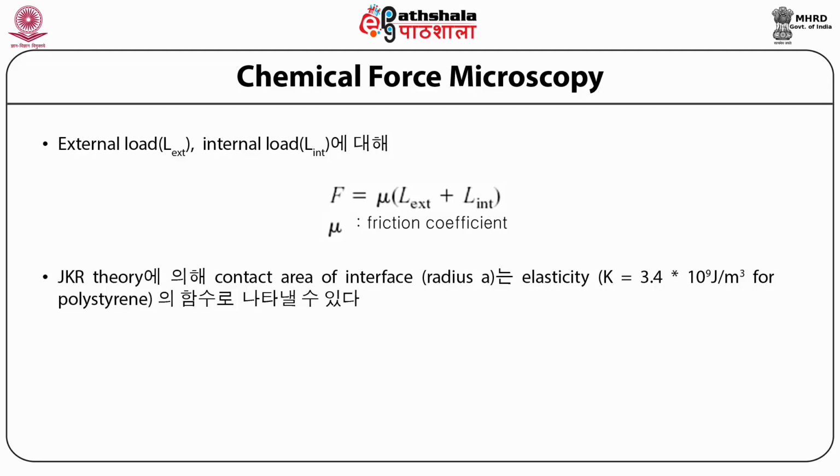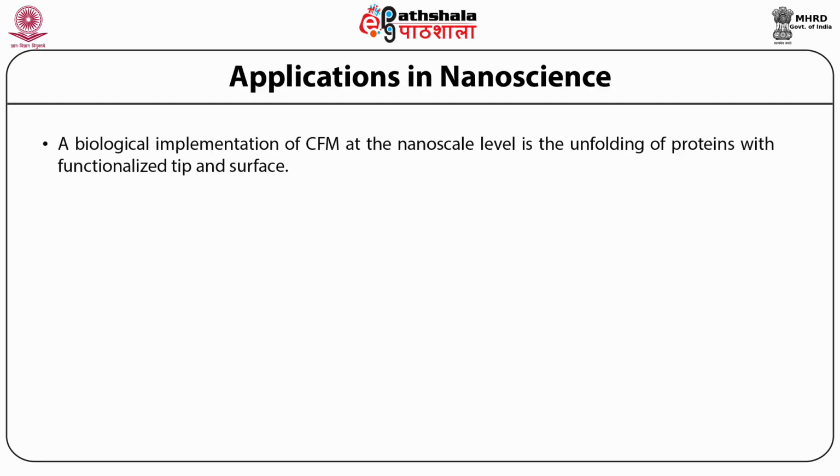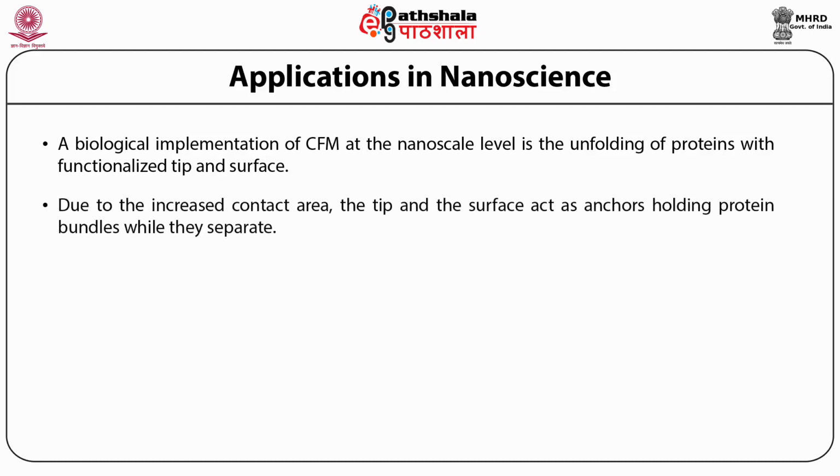JKR theory, where the contact area of interface can be calculated, has also been shown to be there for this. Applications in nanoscience. The CFM has very many applications in the very important area called nanoscience. A biological implementation of CFM at the nanoscale level is unfolding of proteins with functionalized tip and surface. This is due to the increased contact area.